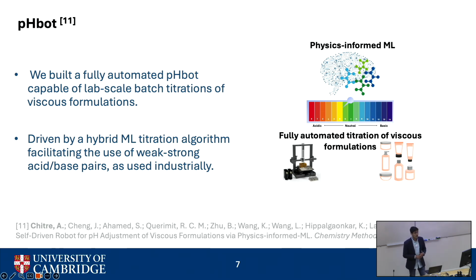Another challenge we had was that I'm working with highly viscous formulations, and so we had an engineering challenge in terms of designing the pH bot appropriately for full automation. We had to optimize the cleaning and mixing protocols, and we were able to do so.